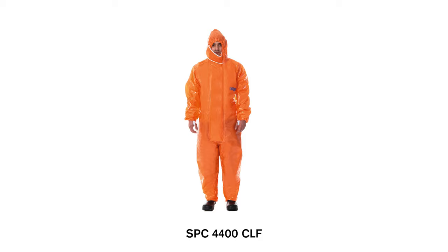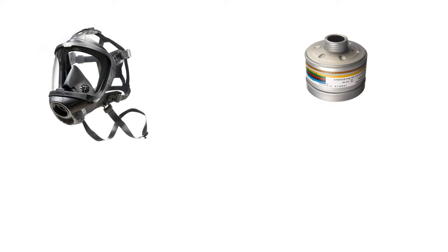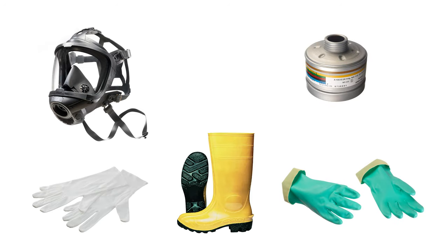In the following, we will show you how to put on and take off the splash suit correctly using the SPC4400 CLF. The suit is equipped with a full face mask and filter, cotton gloves, chemical protection gloves, and protective boots as an example. For handling certain hazardous substances that require extra sealing, the protective suit will be additionally sealed with a chemical-resistant adhesive tape. Please also consider your internal guidelines here.